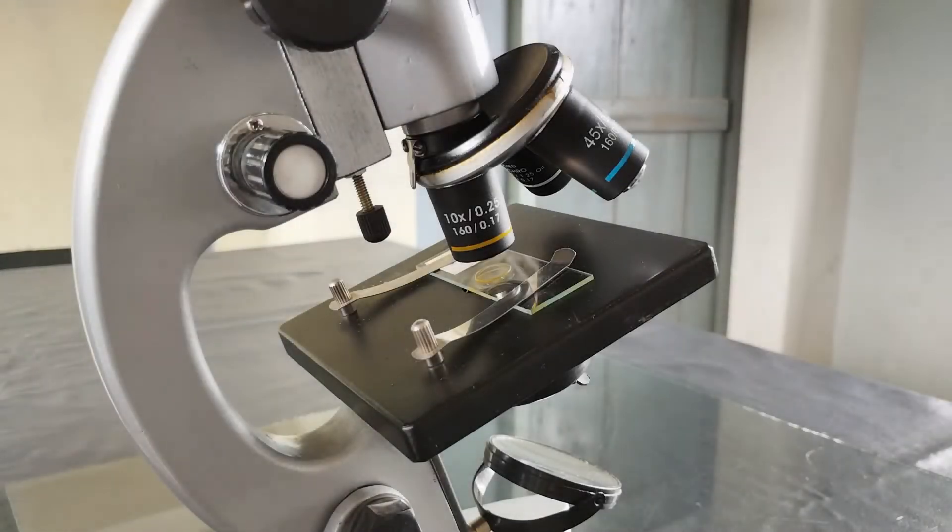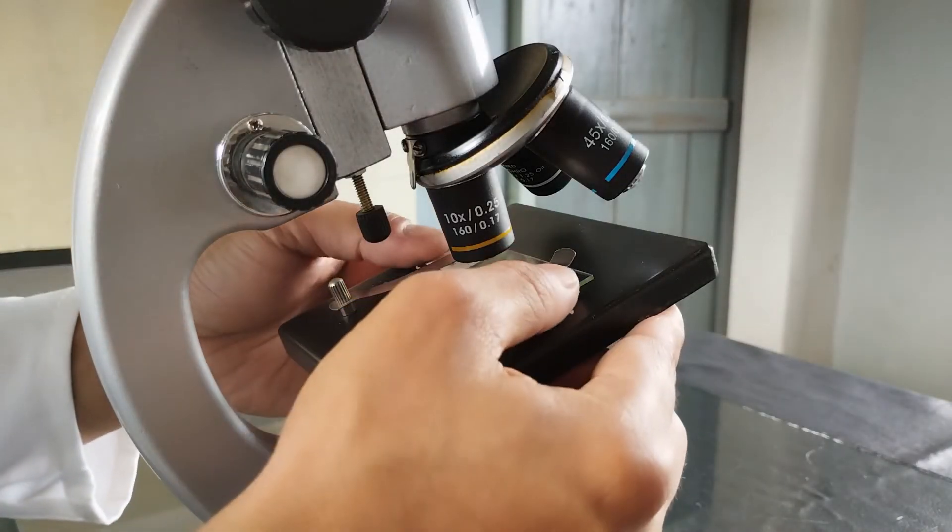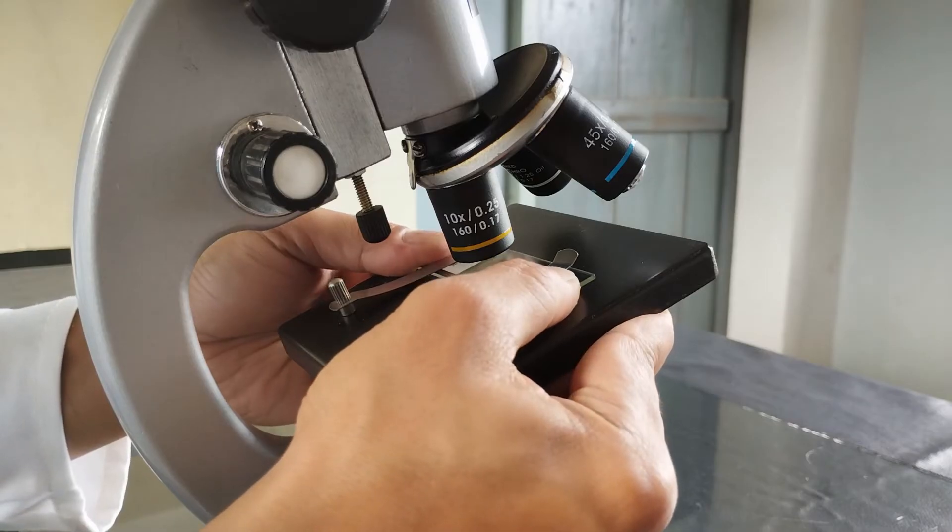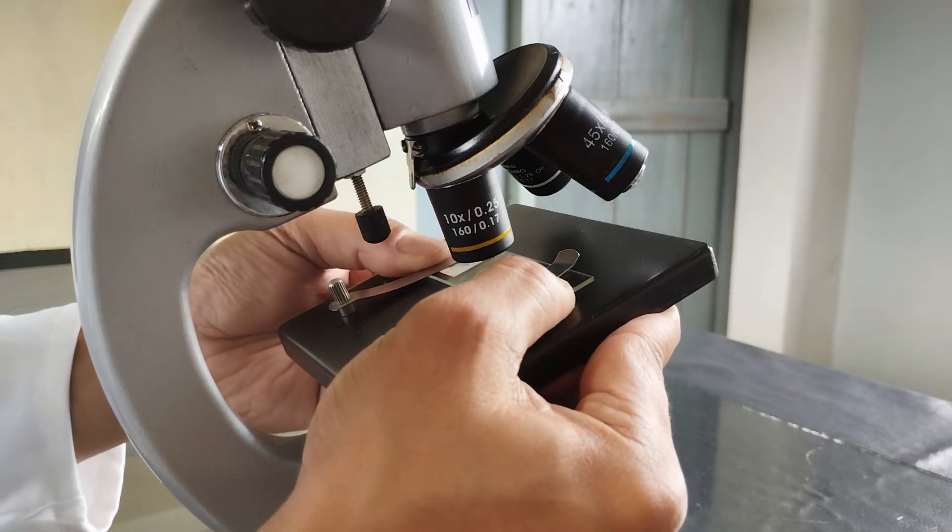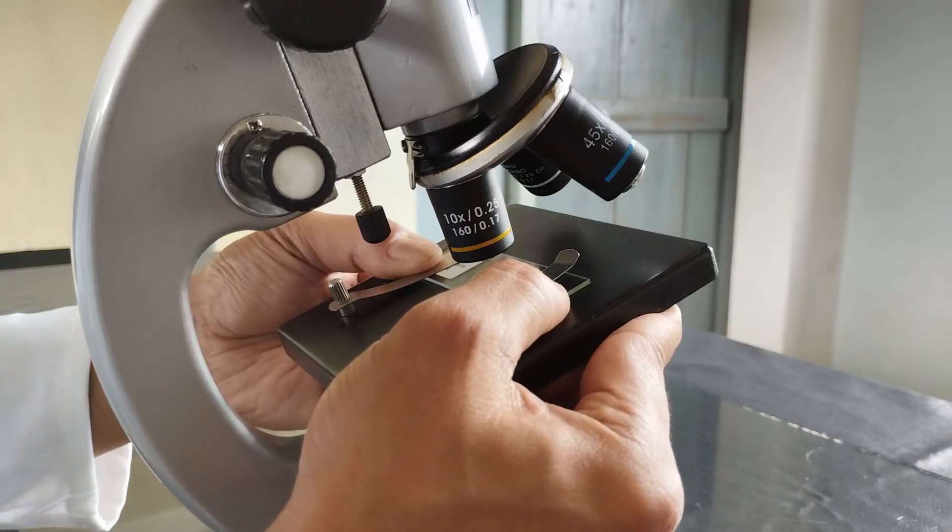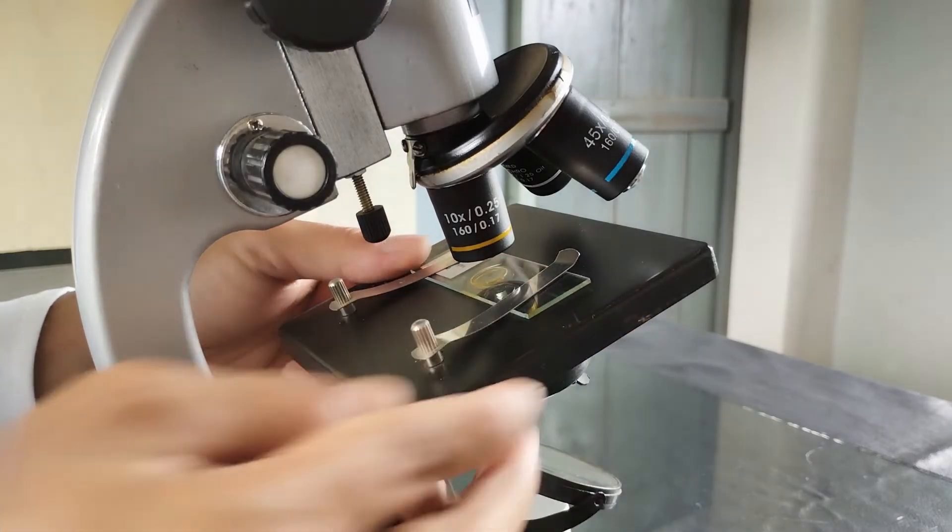Once you're done bringing the specimen image into focus under the low power objective, scan the specimen for the specific region of interest that you would like to observe and study further, by again adjusting the slide carefully and slowly sideways or up and down.